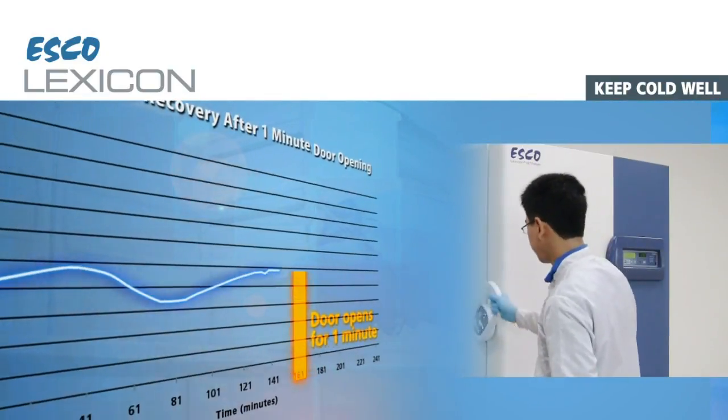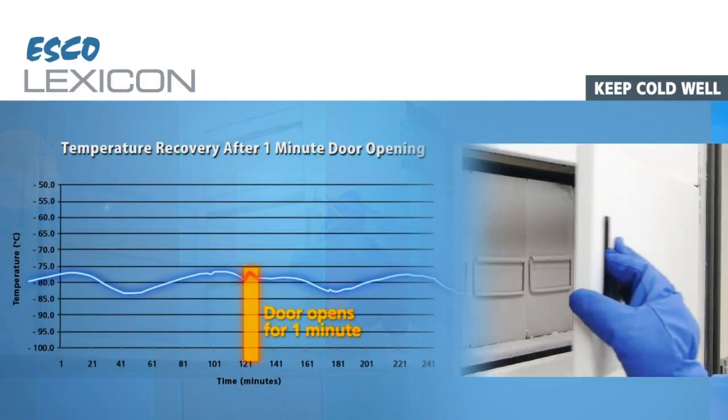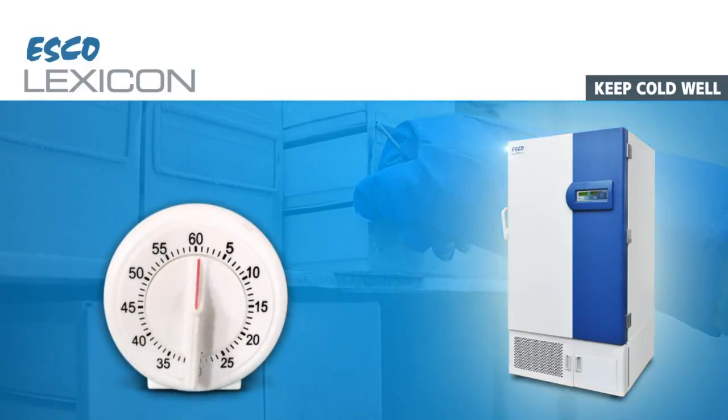The chamber temperature recovers quickly after you open and close the door. Thanks to my powerful compressors and cleverly designed cooling mechanisms, I could pull down the temperature in just a few minutes. A good freezer shouldn't take long to cool down.